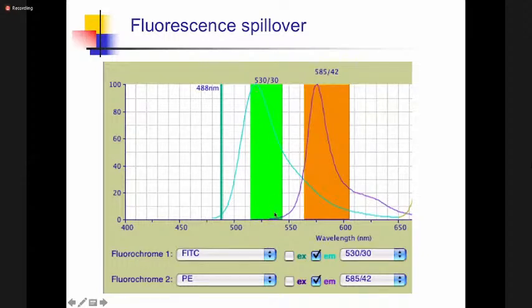Again, I think this I will correlate with you probably when I'll be teaching you clonality testing. How do I distinguish between a tumor and a non-tumor, which is the technique of clonality testing? Then it will come out to you quite clear. These signals and the peaks at the wavelengths which you are interested in. You cannot analyze a molecule which is exciting at 300 when it is documented that you should be analyzing the peak at 530. This will come out clear to you when perhaps I'll be teaching you about clonality testing in lymphoproliferative disorders.